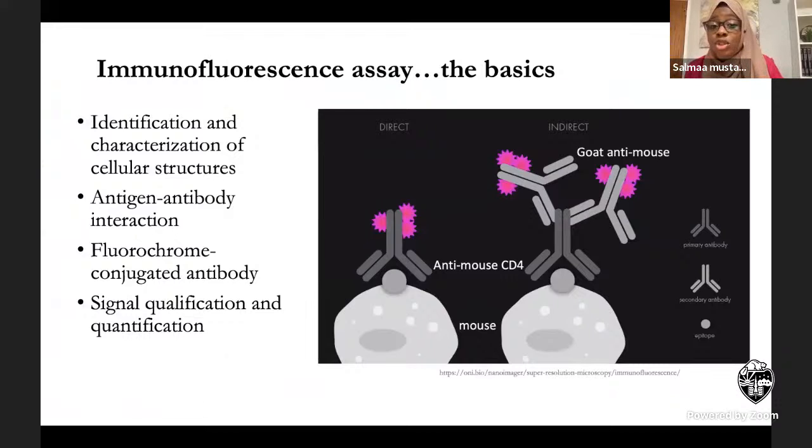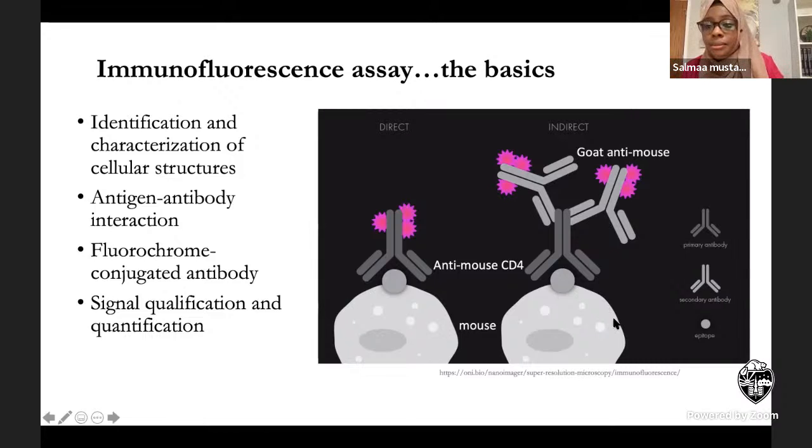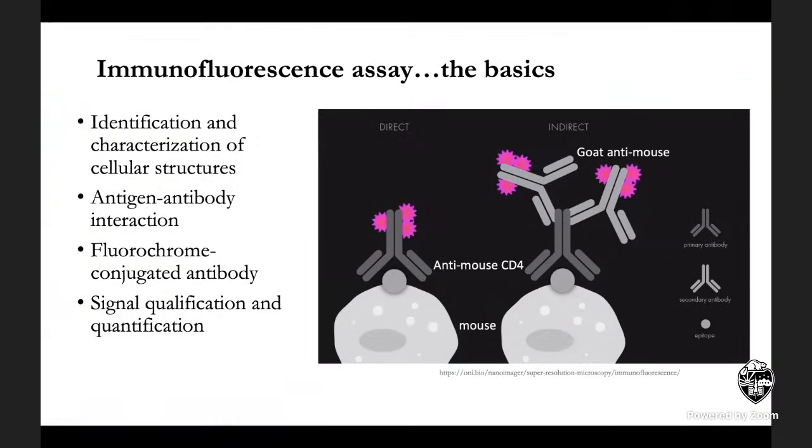So that could also help in cleaning up your signals. Another thing that I usually do that I forgot to mention here is you need to block background signals before you start staining. That would also help with the autofluorescence that you're experiencing. Before I start, what I do is add normal serum. There are several types that you can use. You block autofluorescence or non-specific protein binding with that serum. Then you start. It usually gives you a cleaner signal.